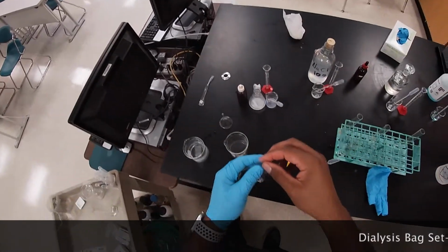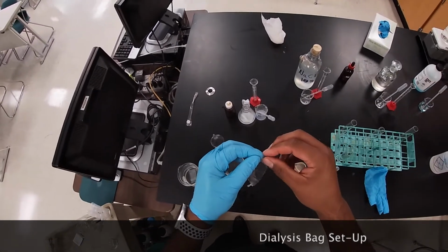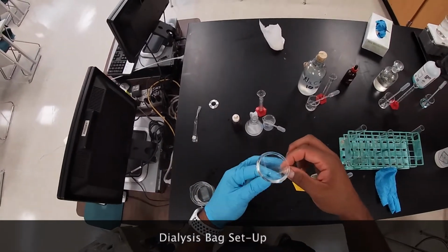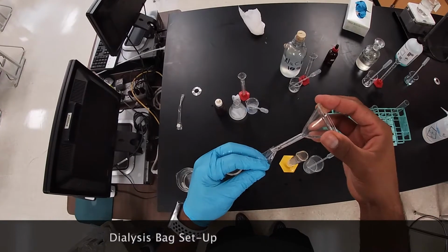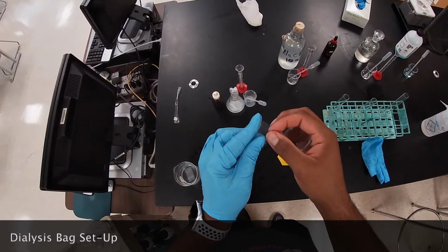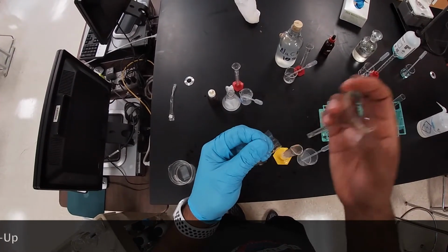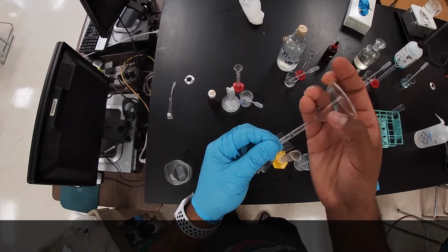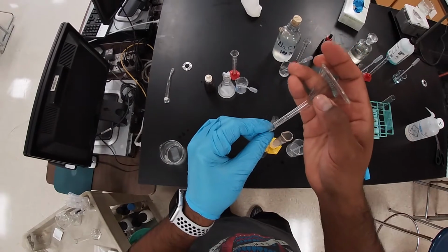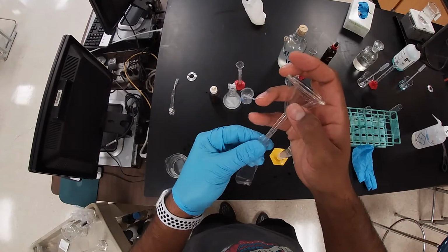Okay, we went ahead and opened the other side. We're gonna go ahead and add our 20 milliliters of our mixture. We're gonna get our funnel. We're gonna find our opening here. Oh, come on. Does not want to cooperate, huh? There we go.